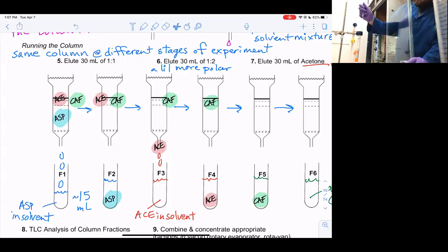Just keep doing this until we see about a centimeter of liquid on top of the sand. That's the point where I'll actually take this and pour. At that point, I'm not too worried about kicking up the sand in our top layer of silica. But we just keep adding and adding.